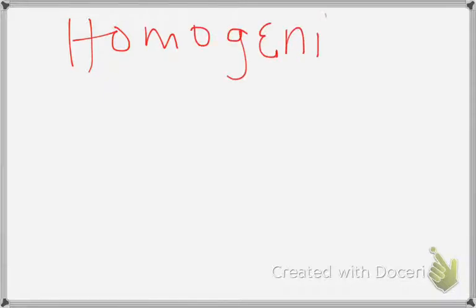is, and it's also got a great name, that's the homogenizer, which those are really expensive. And this works for both yeast and bacteria. And it just looks like a big box. So we had a homogenizer in the last lab. Well, actually, the last two labs I worked at. At Michigan, I should say. And what it does is inside the box, it's just got a pump on one side. You put your beaker, your flask of bacteria on one side. You stick the little tube in it, and it's going to suck the solution into the big box.